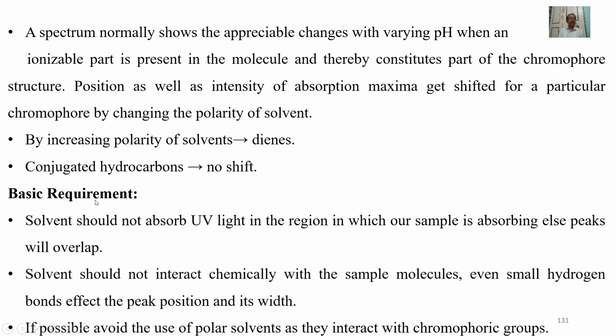Basic requirements. The solvent should not absorb UV light in the region in which our sample is absorbing, else peaks will overlap. Solvents should not interact chemically with the sample molecules. Even small hydrogen bonds affect the peak position and its width. If possible, we should avoid the use of polar solvents as they interact with the chromophoric groups.